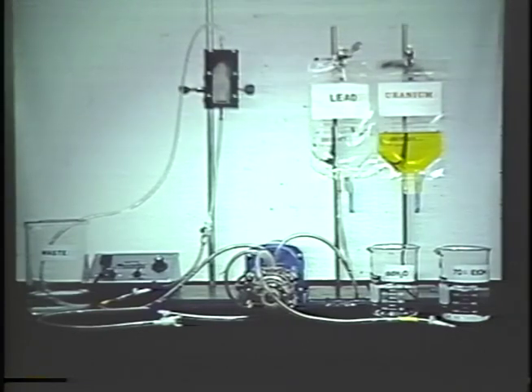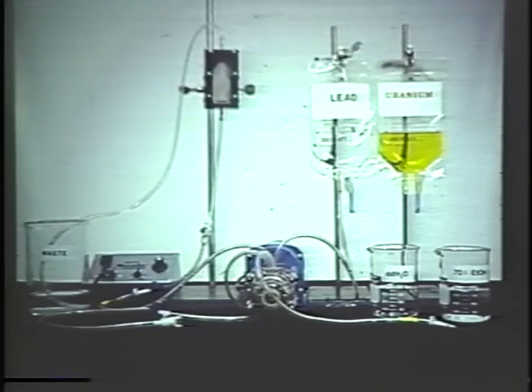So here is the stainer with the grid plate, and we put the stains into blood bags that we get from the hospital. That way the stain is never exposed to the atmosphere. We use a peristaltic pump to pump out the stain, and the bags collapse so that the stain comes out and air doesn't go in there to contaminate the stain. This way we can keep lead stain for 6 months or more when it's wrapped up in aluminum foil.